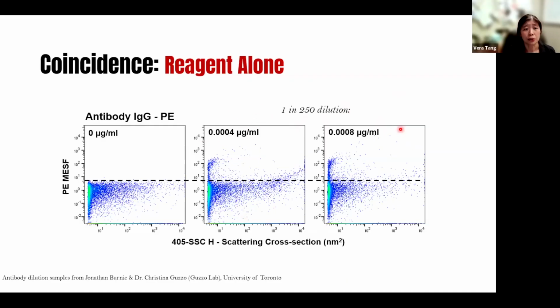So when we're talking about the actual concentration, the fluorescence signature changes. So this is how you know that the more concentrated sample was actually swarming or we were getting coincident detection. When you dilute and you see a shift in that profile, I can tell that the background here has come back down to where the PBS is. So I know that this is probably more true in terms of the actual single particles of signal.